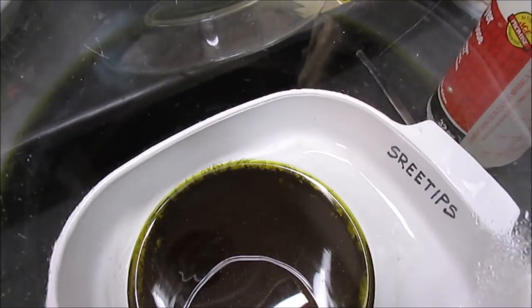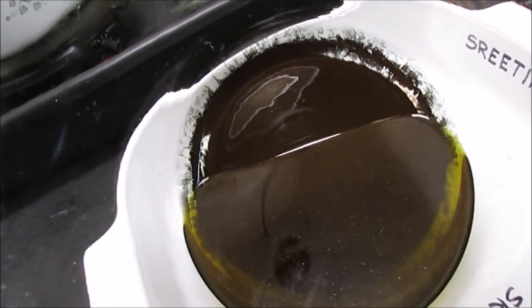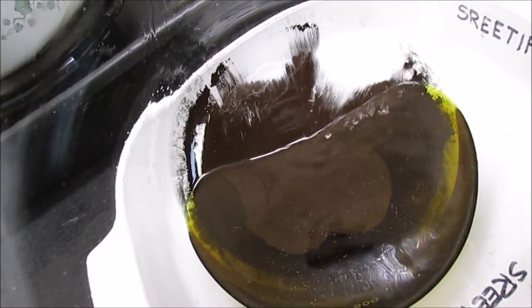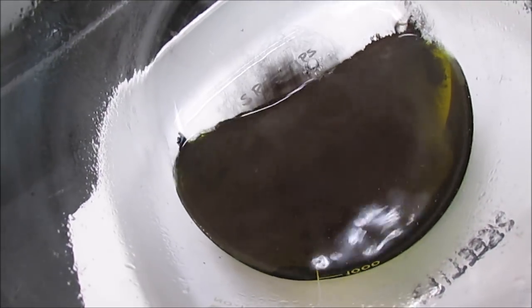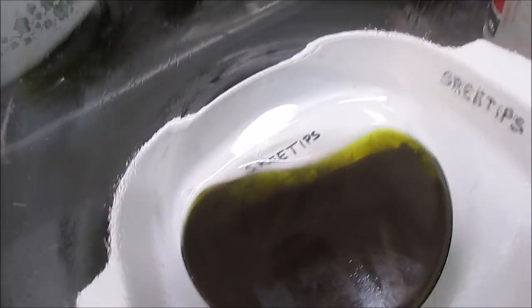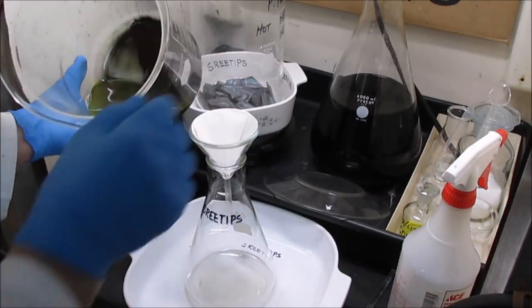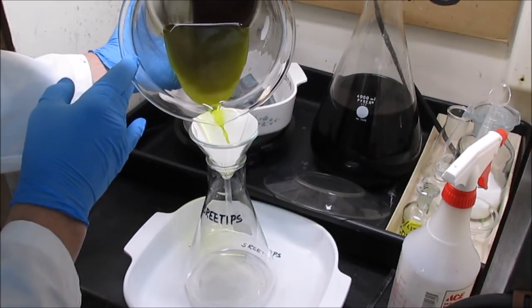Okay, here's our gold. The brown powder at the bottom is our gold. What I'm going to do here is filter off the rest of the solution and gather up our gold, and then we'll do a melt and get a yield. Now I'm going to get the gold out of the beaker by pouring it through a filter paper, filtering off the solution and capturing the gold in the filter.